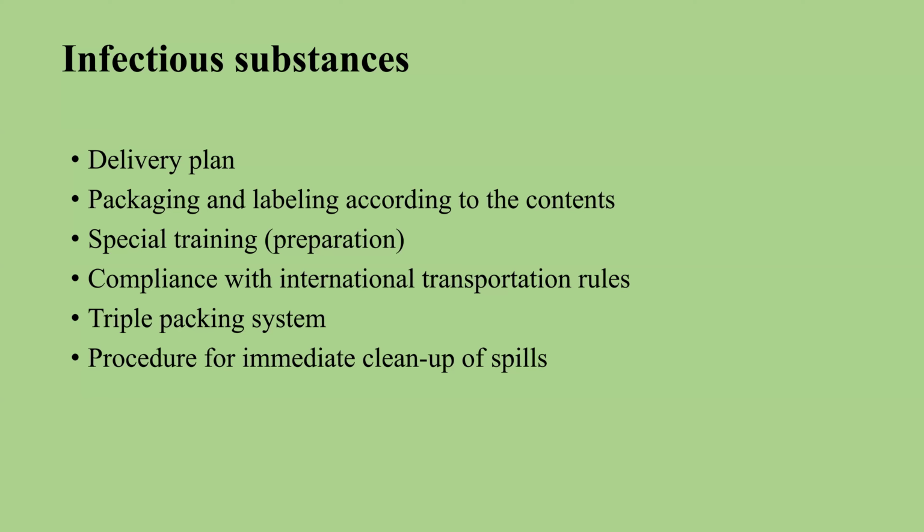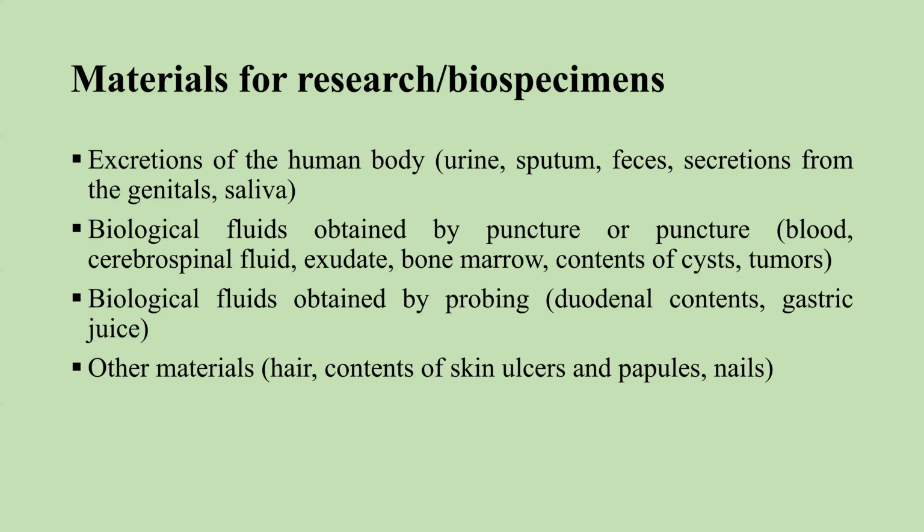If you work with some infectious substance, some biospecimens, material from sick people, you should have a delivery plan for this material and take special training before. There is a triple packing system: all this material has three packages to prevent the spread of infection. And of course, there is a protocol for utilization in case of some problem or catastrophe.